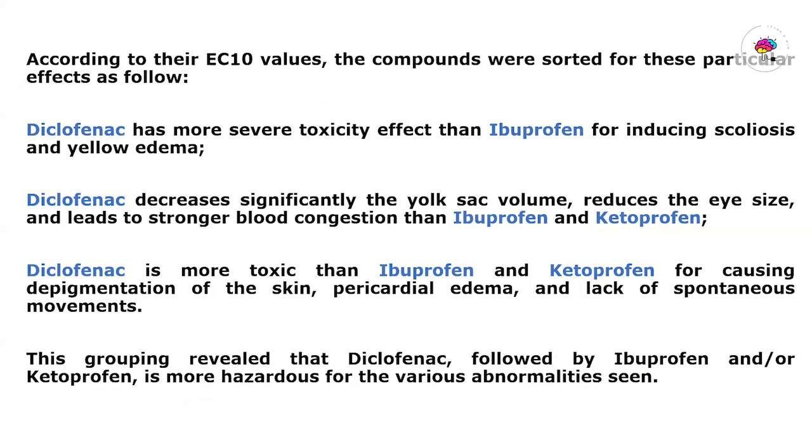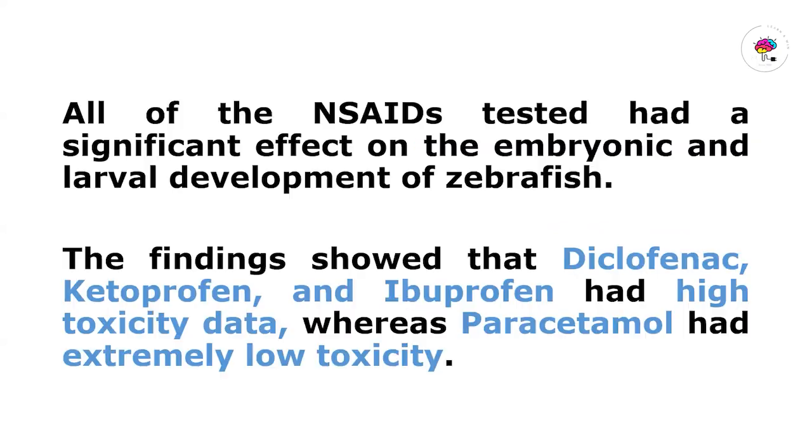Moreover, we can notice that diclofenac has more severe toxicity effects than ibuprofen and ketoprofen for inducing scoliosis, yellow edema, blood congestion, depigmentation of the skin, decrease of the yolk sac volume, reduce the eye size, and causes lack of spontaneous movement.